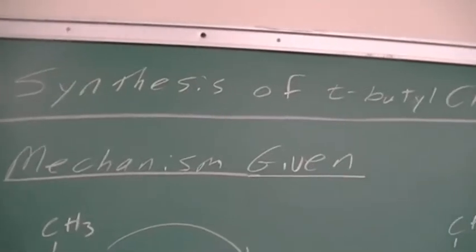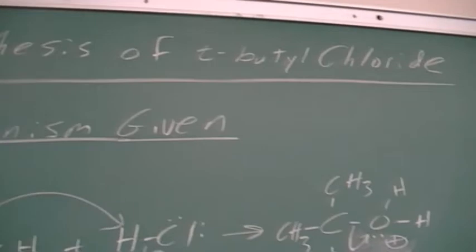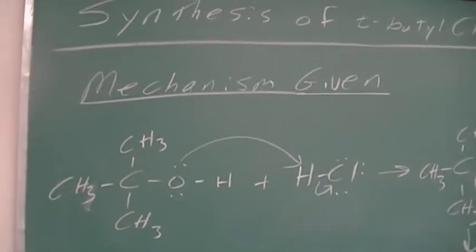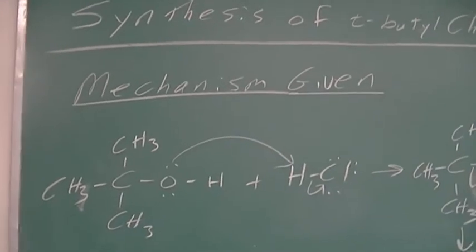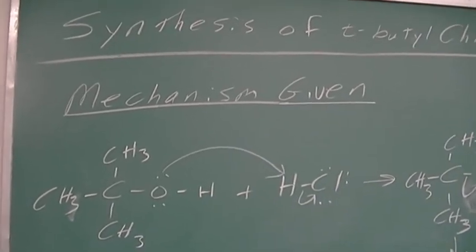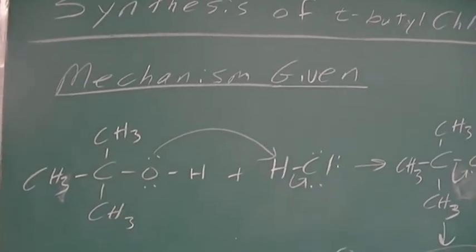Today we're going to do the synthesis of T-butyl chloride. So this is our first reaction experiment that we're going to do. When I give all of these reaction experiments, most of them from now on will be reaction experiments, I'm going to give you the mechanism. And this is how I'm going to give it to you.